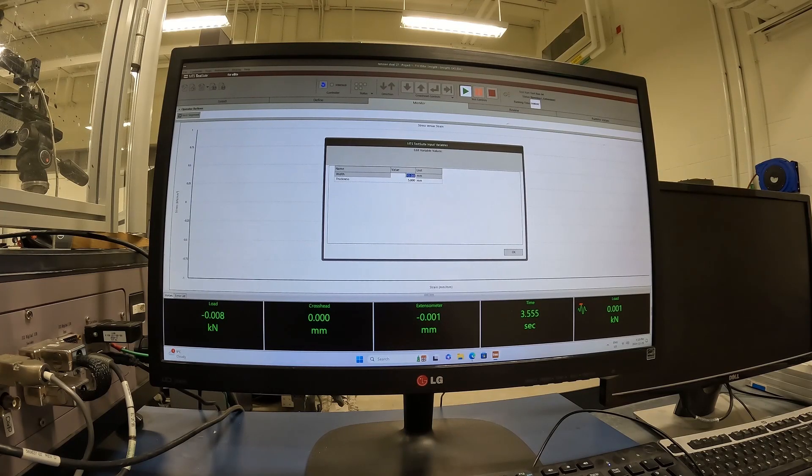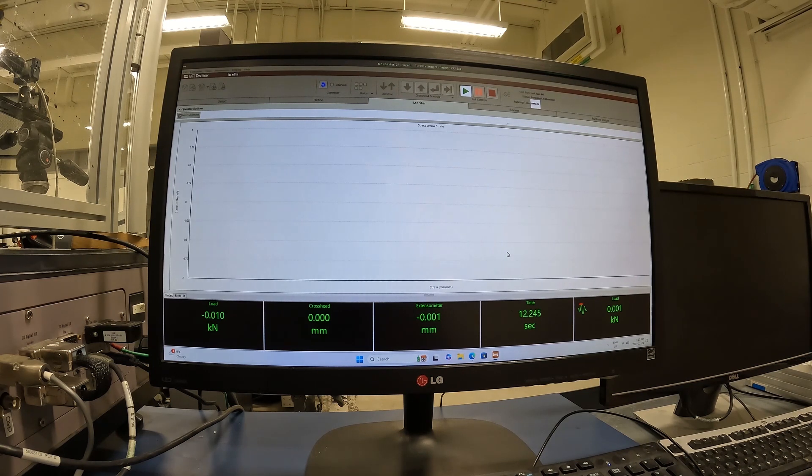This prompt is just to make sure I have the proper width and thickness measurements of the gauge length region of my tensile sample. This looks good, so I hit okay, and now we'll watch the curve generate.